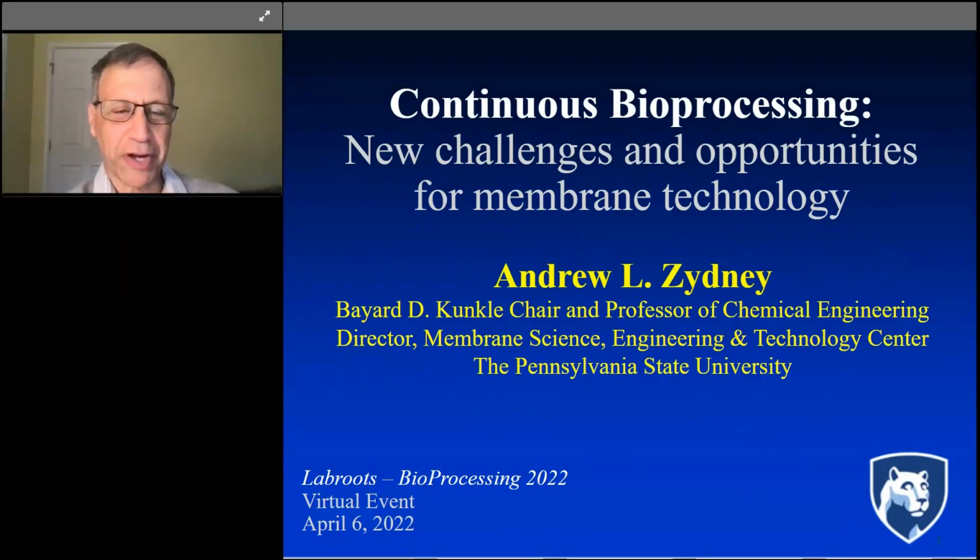Well, thank you for the introduction. It's really my pleasure to be here today to tell you about some of the work that my group has been doing in the area of continuous bioprocessing, with a particular focus on the application of membrane technology for the continuous purification of monoclonal antibody products.